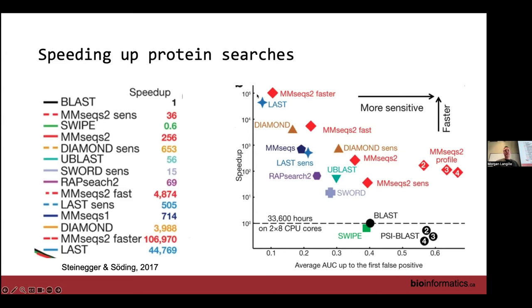But what's cool, this is the big thing here, is that they have this two-staged mapping process. They look at the taxa and decide with MetaPhlAn which taxa exist. So they base their first step on MetaPhlAn predictions. Then they say, okay, these taxa exist, so now we're going to limit our search by searching our reads to just those taxa. They do that step with Bowtie, which we know is fast, and it's limited to nucleotide and very high similarity searches. But the idea is that if we know these taxa are in here, let's first collect all the reads that map to these species, right?